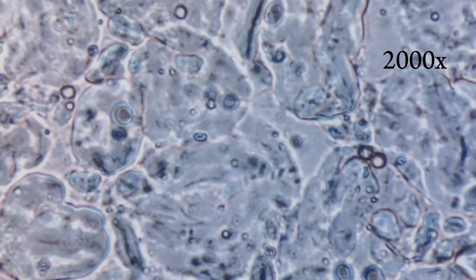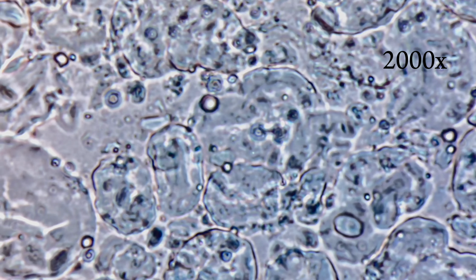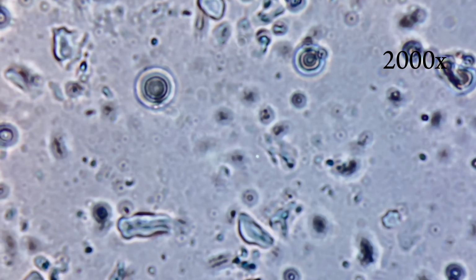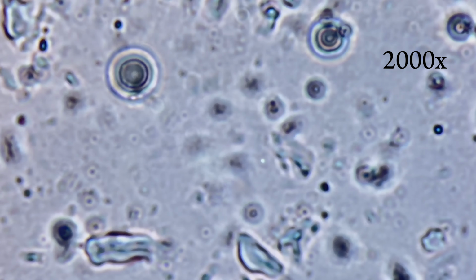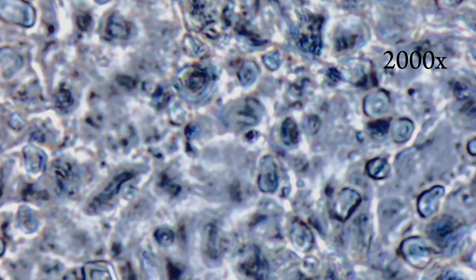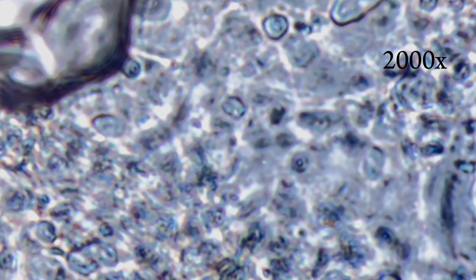At 2,000 times magnification, the structure fills the entire field of view and becomes almost abstract. The material appears highly fragmented and layered, with countless tiny, rounded, and irregular formations packed tightly together. Clear boundaries between micro-components are visible, showing how the structure is organized on a very small scale. Some areas look compact and dense, while others remain loose and porous, highlighting how uneven and complex bread truly is.